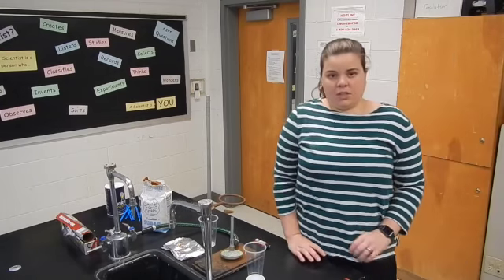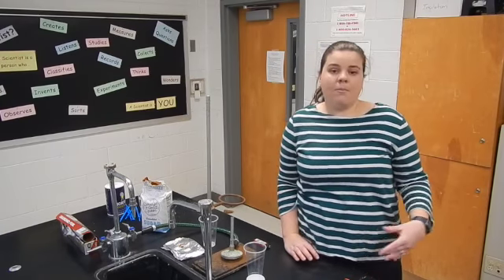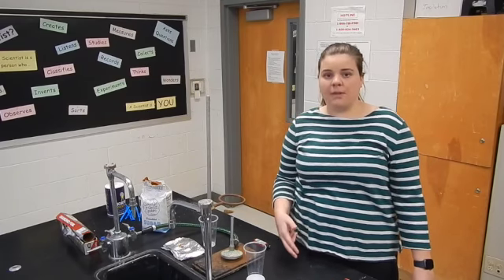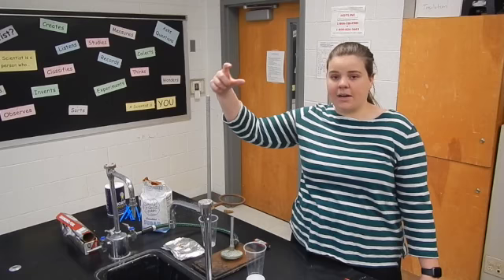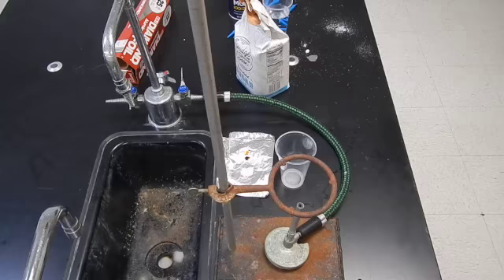The first thing we're going to talk about to fill in for salt versus sugar is the relative melting point. Which one melts faster, which one melts slower. So I'm going to put the camera right above here so you can watch what's happening with the Bunsen burner.